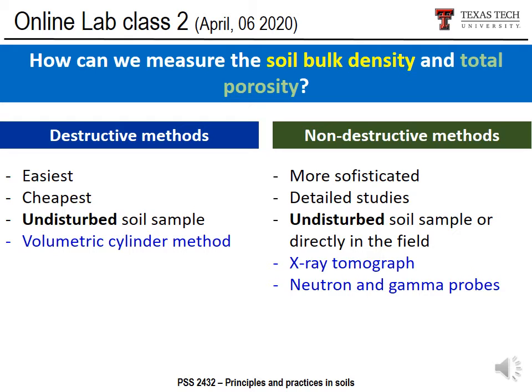I had plans to collect undisturbed soil samples in the field for you all, but unfortunately it's impossible now. Okay, we have non-destructive methods, and they are more sophisticated. Sometimes for more detailed studies I can use undisturbed soil samples, or I can measure directly in the field. For example, X-ray tomography and neutron and gamma probes.